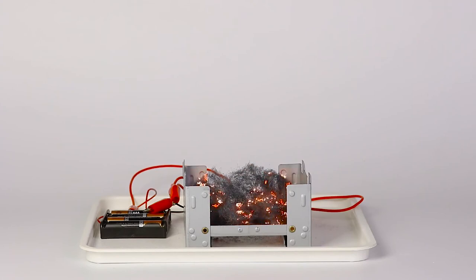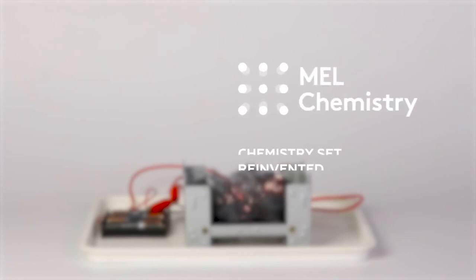So, the wool burns, which means that it reacts with the oxygen in the air, yielding a mixture of iron oxides. Learn more about this experiment on our mel science website.